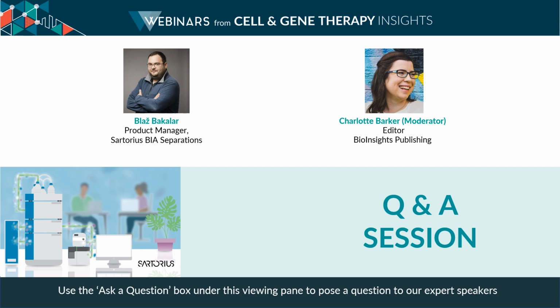Brilliant. And could you provide information on what type of bioreactor was used for the fed batch? So for fed batch and continuous feeding, what we used was an Amber system. I think it's a very common thing, and actually quite a lot of clients already utilize Amber for these purposes, especially for IVT.